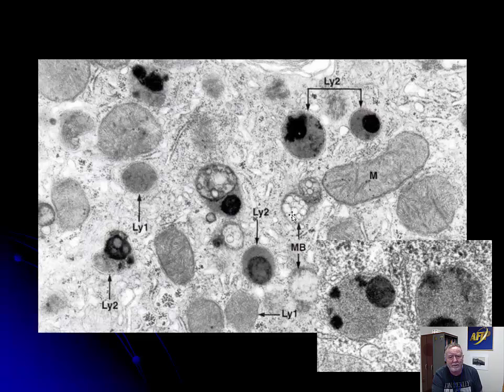they're called multivesiculate bodies. And what will happen is this multivesiculate body is going to fuse with one of these primary lysosomes, become a secondary lysosome, and then the proteases and the lipases in the lysosome are going to break down that fat, give us something that attracts osmium that will look like a brown granule underneath the glass or under the microscope, and will look like black blobs. And this is a secondary lysosome full of lipofuscin.